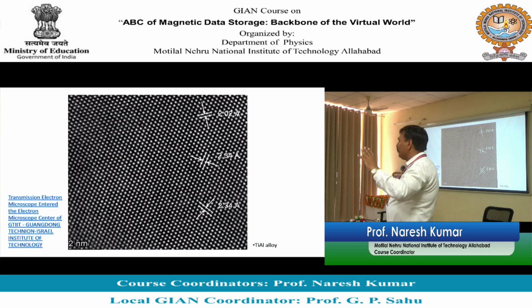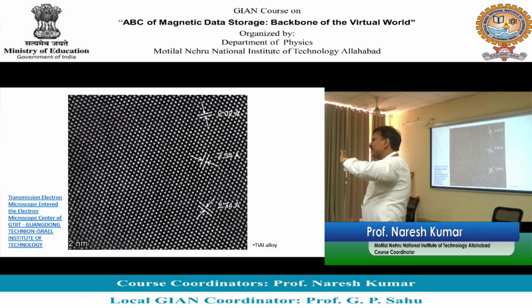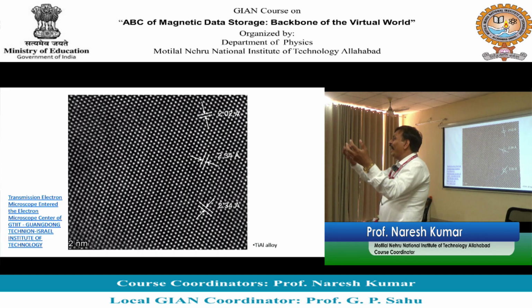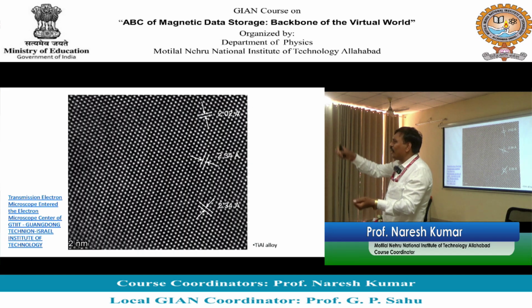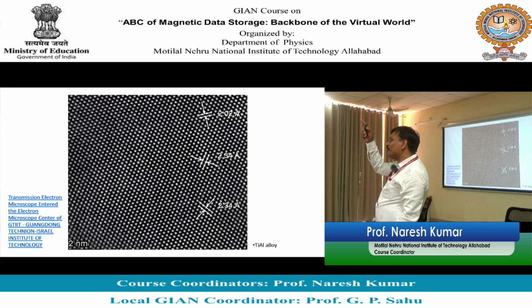So diffraction pattern बहुत पुराना है. कितना पुराना है सर? ये 100 साल से ऊपर, 125 के आसपास हो गया है सर. So this phenomena is very old. The only thing is light is there. जो आपका grating से हमने बात किया उसको replace करना है किससे? किसी भी crystalline material से. But the only thing is to see those diffraction maxima.